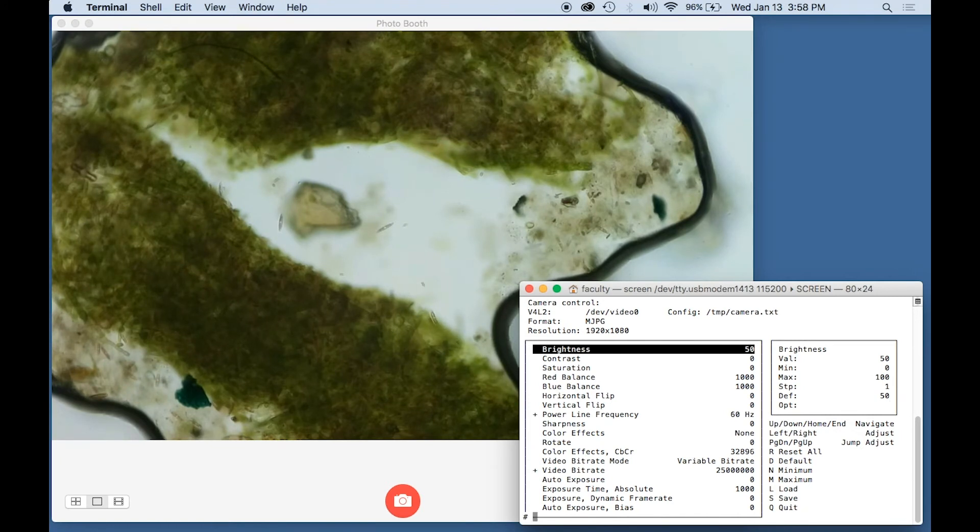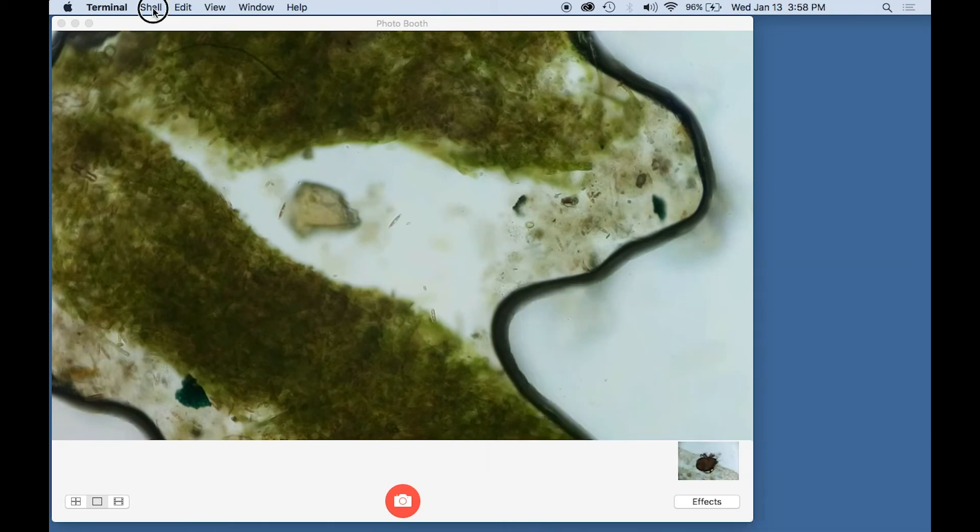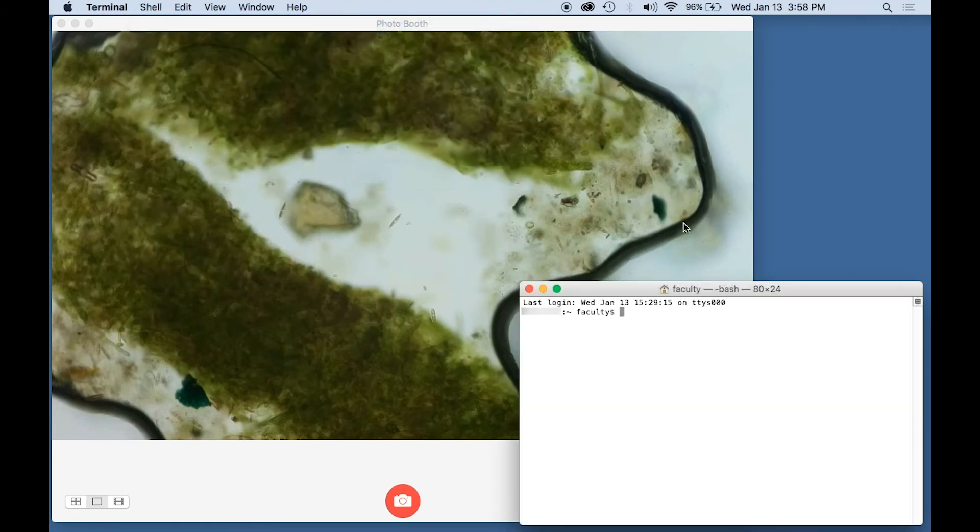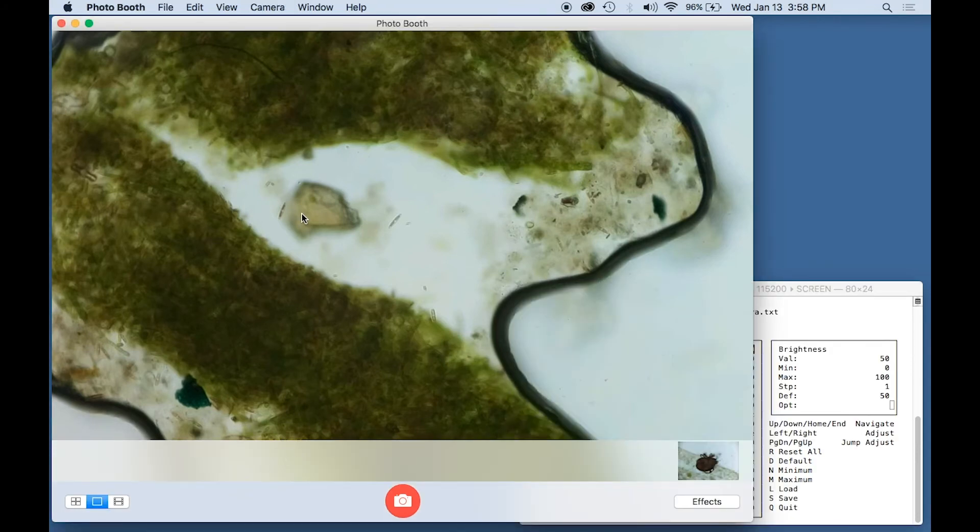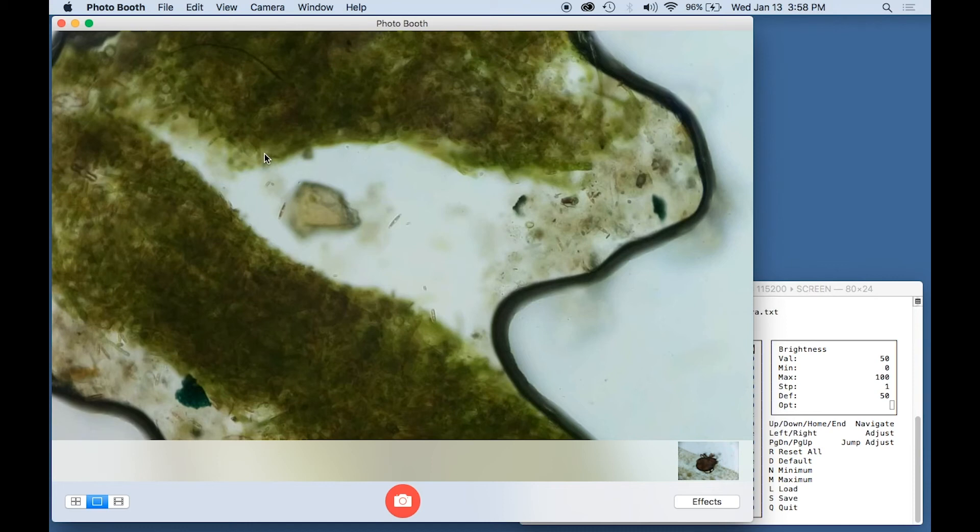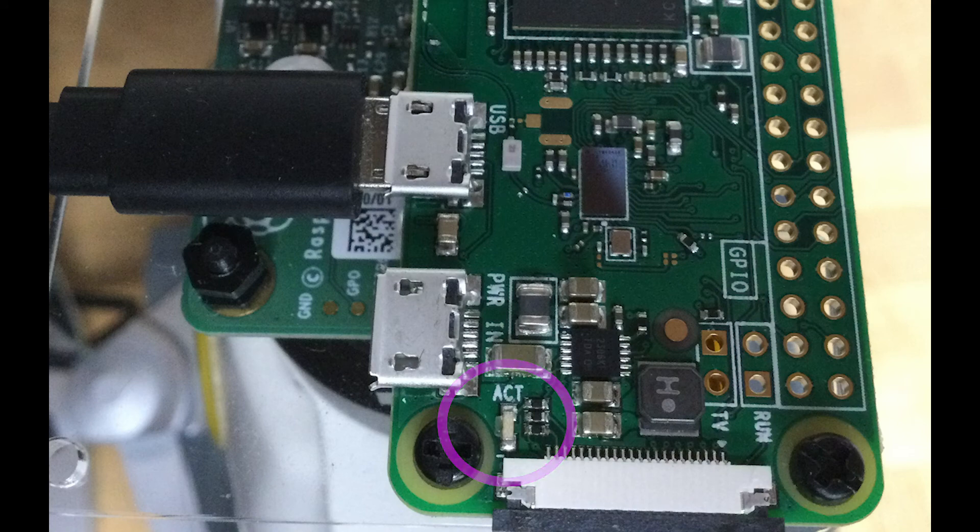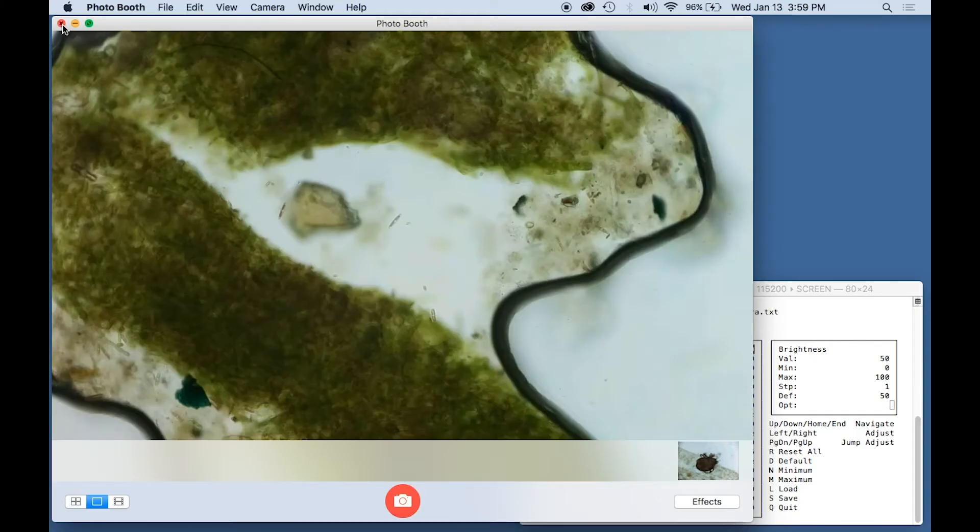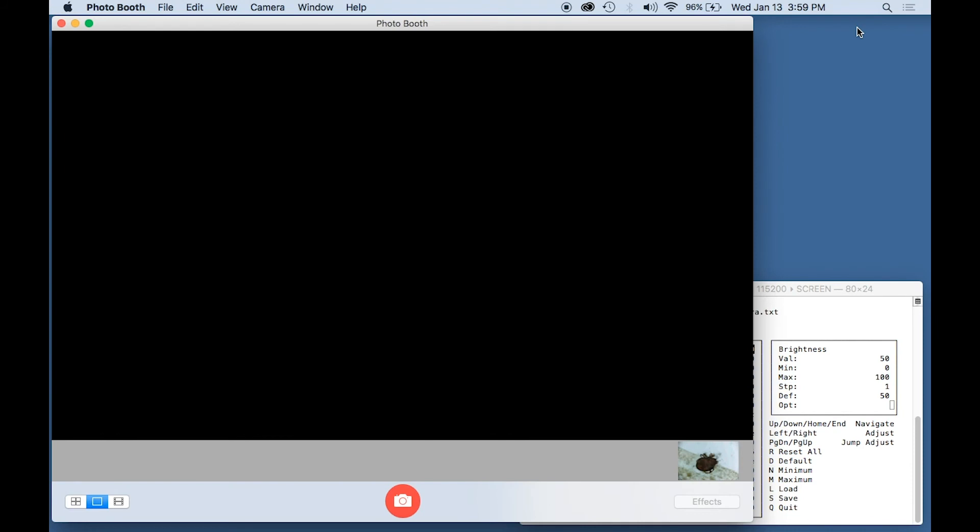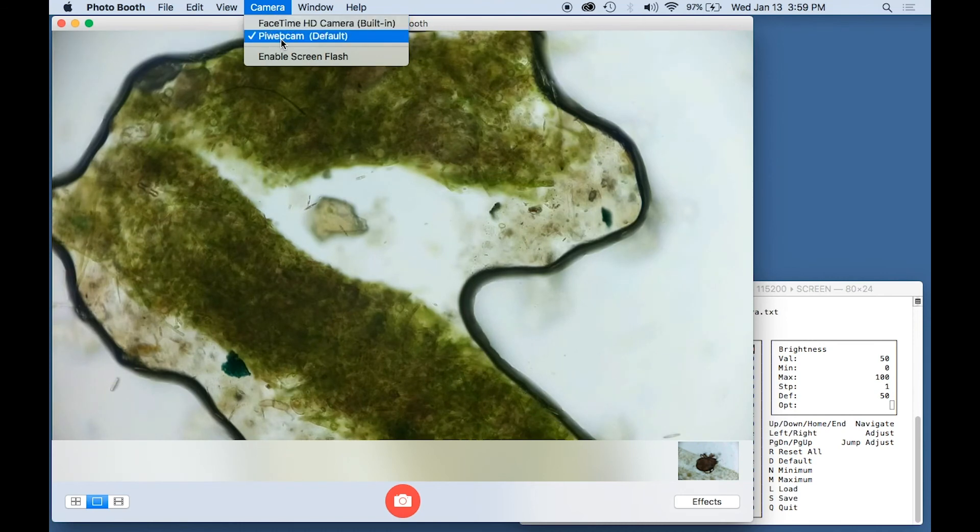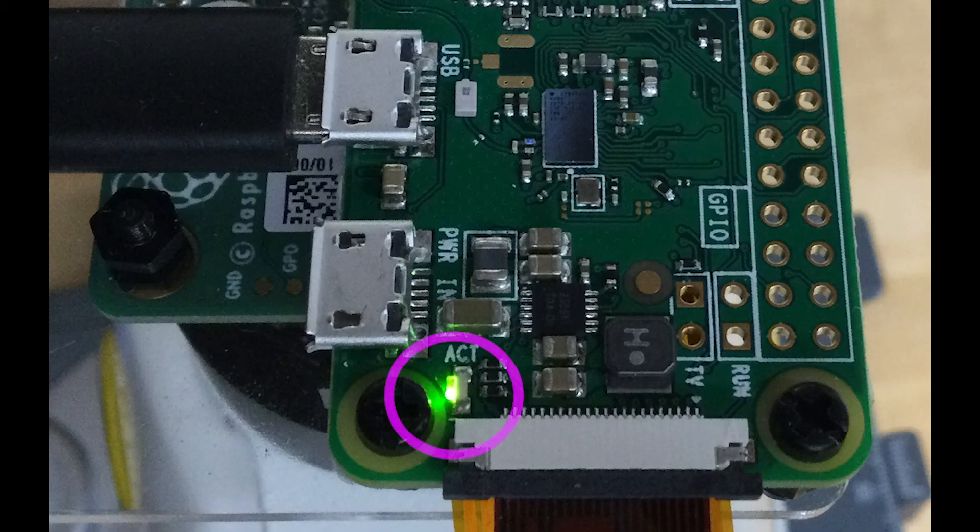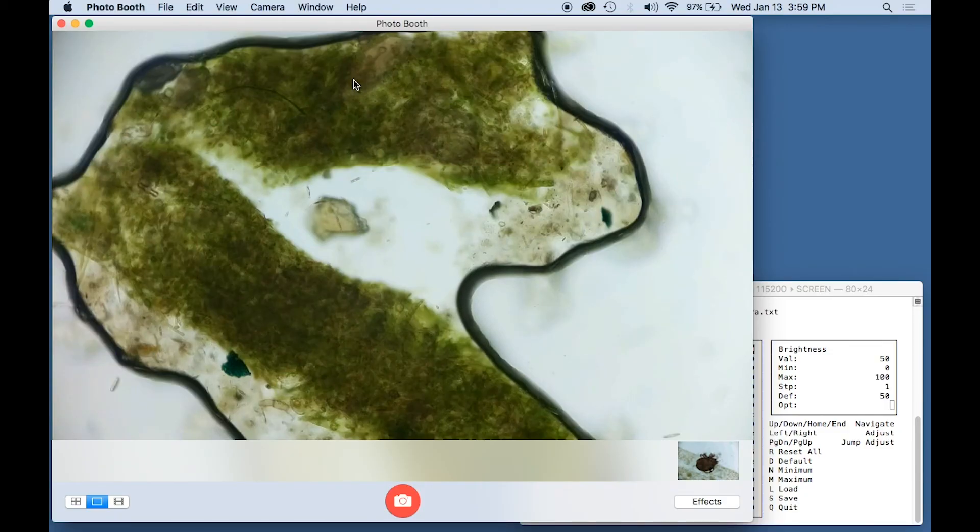Another thing is, let's say you quit out of this, and you've interrupted the terminal session to the Pi, and then you, let's say you start a new session, and try to make the connection, and log in. Everything will look just fine from the Raspberry Pi Zero side, however, you will notice that, even though you have the camera selected properly, that your image is not correct, is not live. And you can always tell that by reviewing the LED on the top of the Raspberry Pi. It's not lit. So the solution to that is you close out the application photo booth, and start it up again. And you'll see the image is black, and then it immediately shows the live camera view now. It remembered what camera you had selected, and look at the top of the Pi, you'll see the LED is lit. That LED always lights up when a computer is receiving a video image.